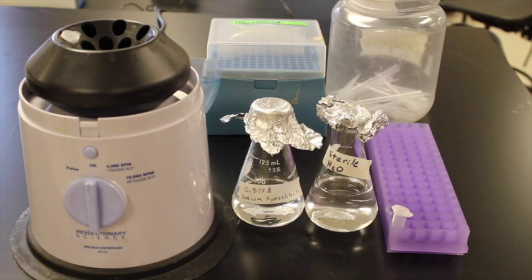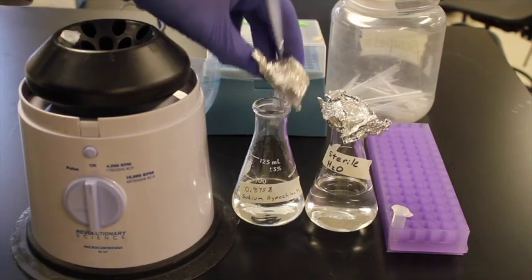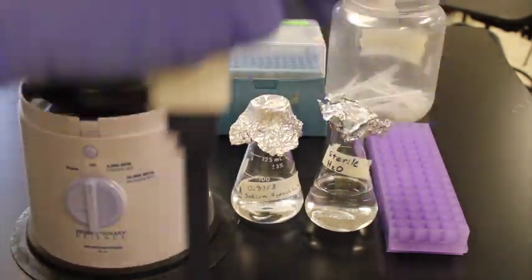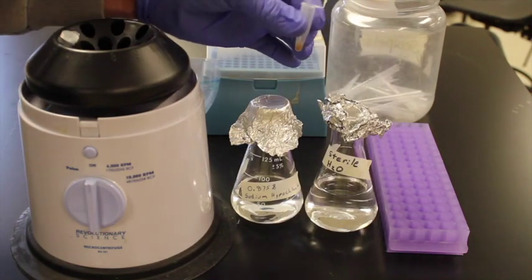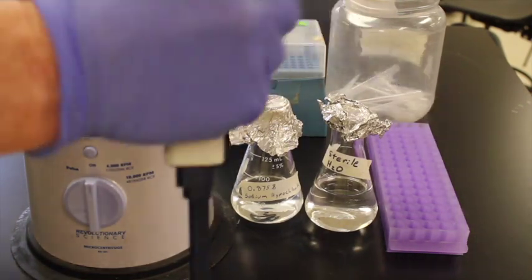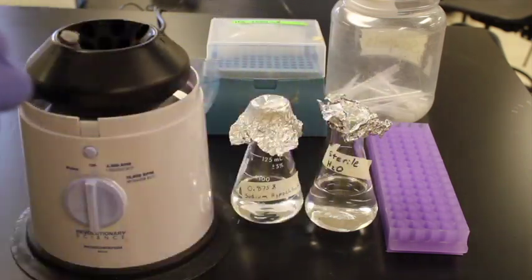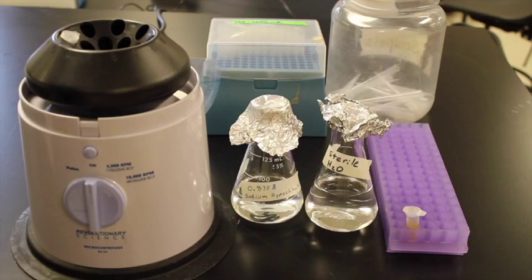We'll then go into the sodium hypochlorite, get one ml from our sodium hypochlorite, add it to the microcentrifuge tube, flick it around a couple times just to make sure. And then we leave it for three minutes.